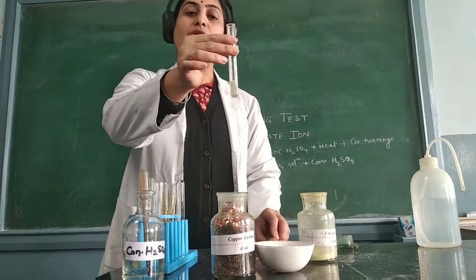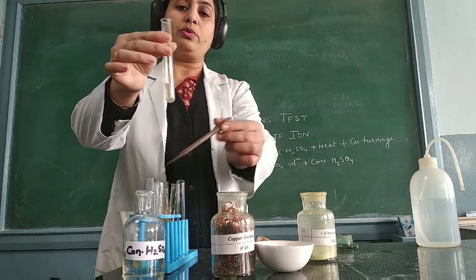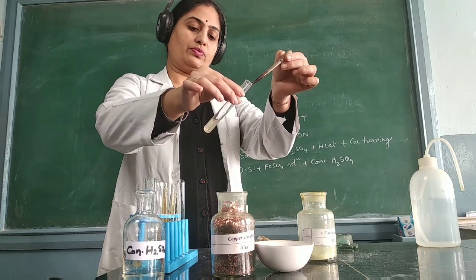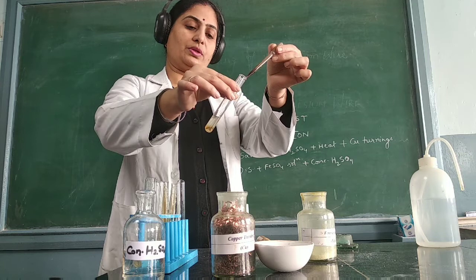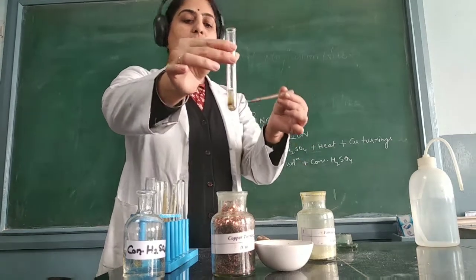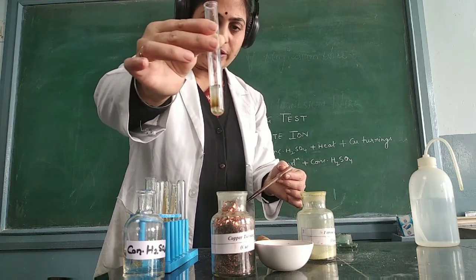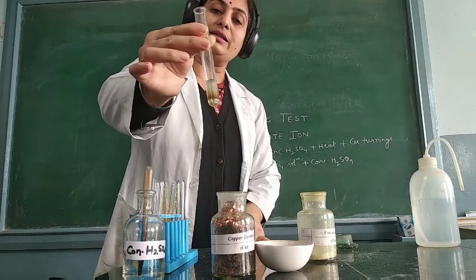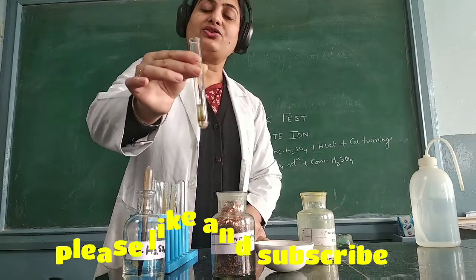Now I add concentrated H₂SO₄ dropwise at the junction of the two liquids. I tilt the test tube so that the H₂SO₄ flows to the junction. You can see a ring has been formed at the junction of the two liquids — this is nothing but the brown ring. A separate clear brown ring has been observed just by adding concentrated H₂SO₄ to this solution. This is the ring test, performed by the nitrate ion, and this is the confirmatory test for the nitrate ion. Thank you so much.